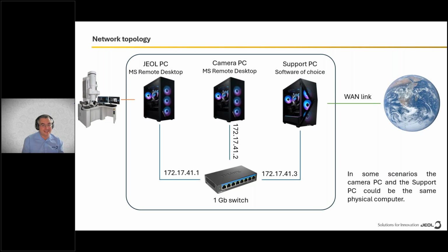If you have a Gatan camera, this is going to be the computer that runs Digital Micrograph. If you have a DE camera, then this is the computer that runs DE server. In the case of TVIPS cameras, this is the computer that runs EM tools, EM menu, or Amplify, the dedicated TVIPS software. In addition to that, you may add another computer.